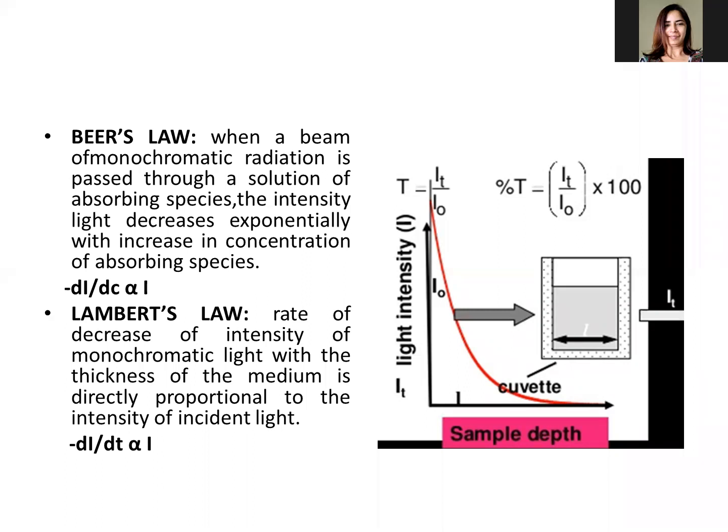The law is commonly applied to chemical analysis and is used in understanding the attenuation in physical optics of photons, neutrons, or rarefied gases. A common and practical expression of the Beer-Lambert law relates the optical attenuation of a physical material containing a single attenuating species of uniform concentration to the optical path length through the sample and the absorptivity of the species.